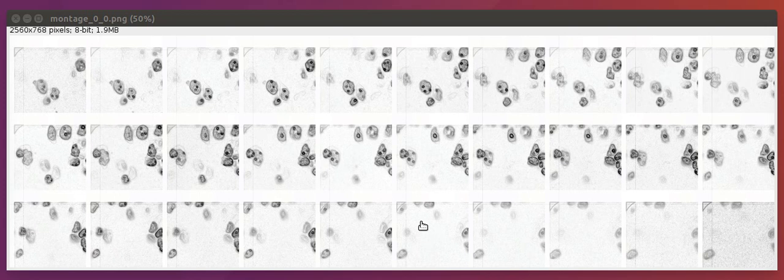So one, when you give cells a label, you should apply that same label throughout all the frames that cell exists in. And two, you should use the three-dimensional context to give cells that might be lying on top of each other separate labels.